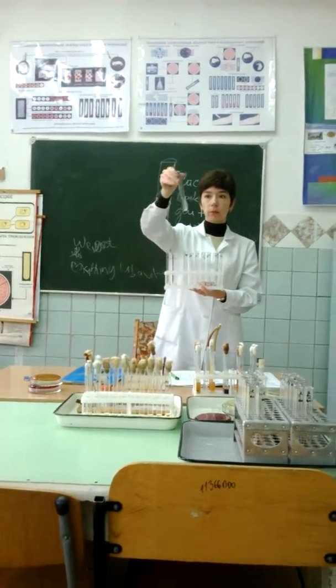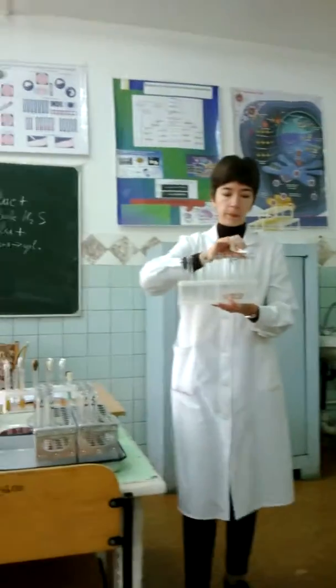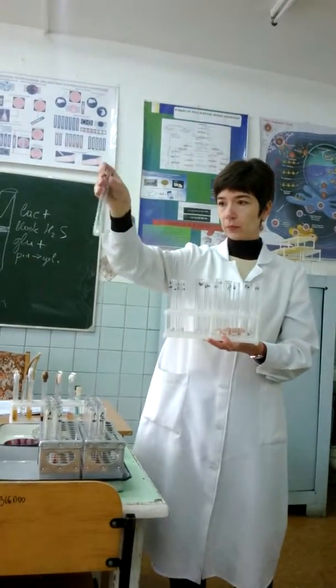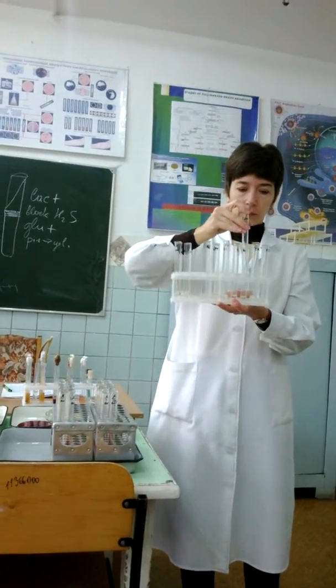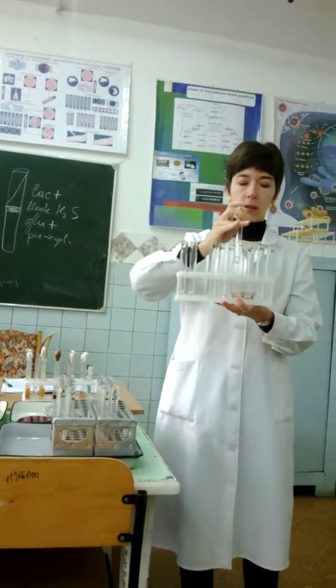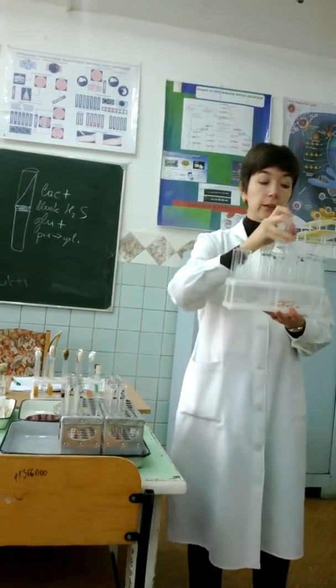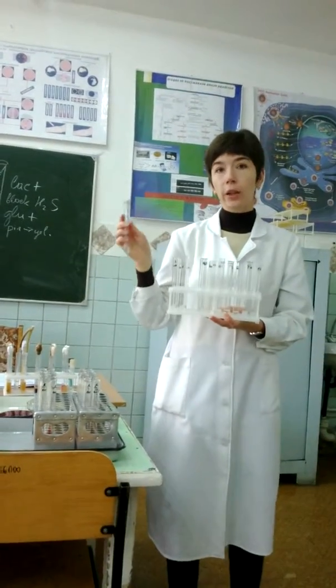We dilute them. Also positive. Also positive. This is negative.